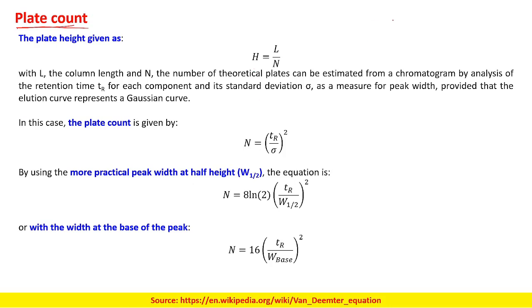Suppose we have this planar chromatographic plate. What we discussed is that we have the baseline where we have put some chromogenic agents. Then we insert this plate into the solvent.